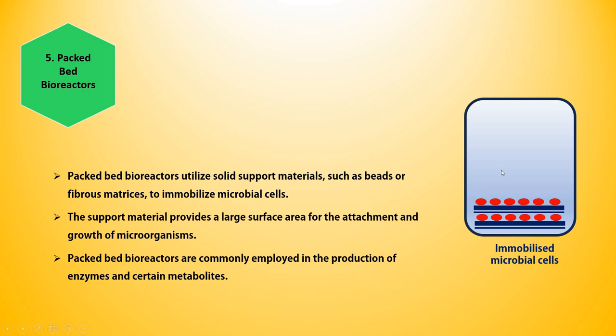During those long processing hours, the enzymes may degrade. For that reason, for sensitive enzymes and sensitive molecules, we use immobilized beds of microbes, which are called packed bed bioreactors.